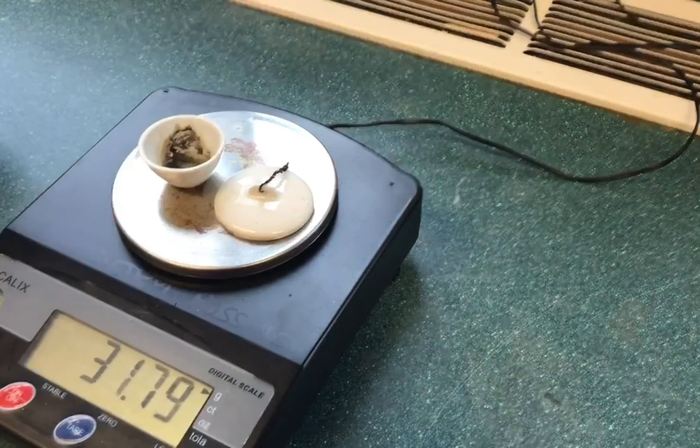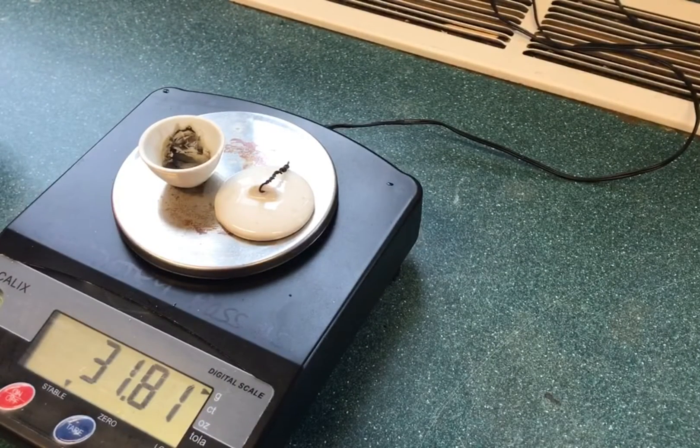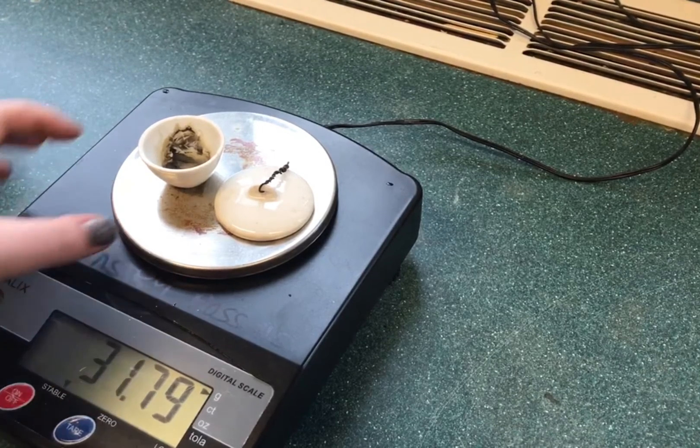Gravimetric analysis is a technique used with solid products. These products can be the products of a precipitation reaction or through volatilization, where you're trying to get rid of water.